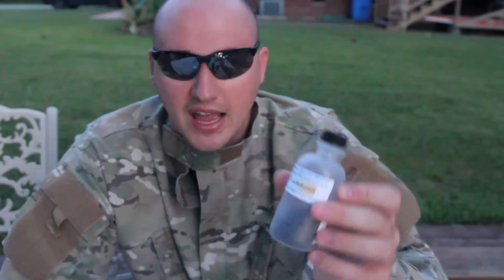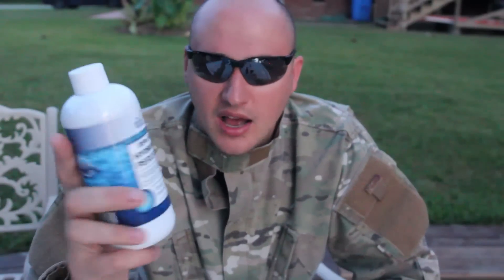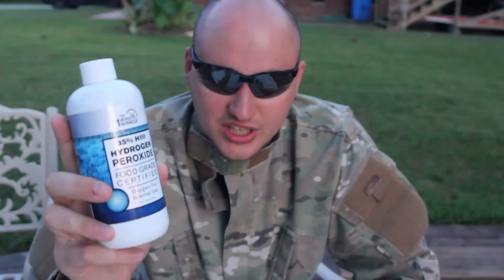What's up everybody? Welcome back to my laboratory where safety is number one priority. Today I'm gonna do a super cool experiment with manganese dioxide and 35% hydrogen peroxide. Let's check this out.